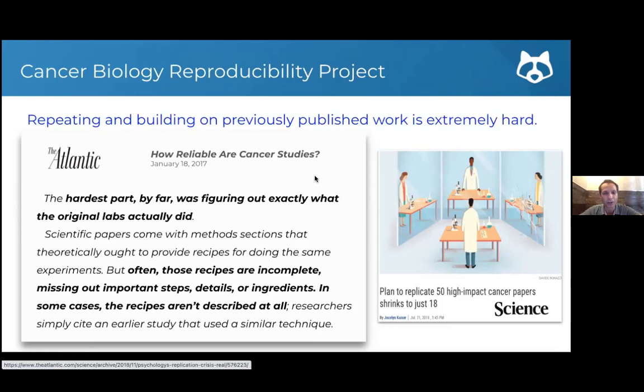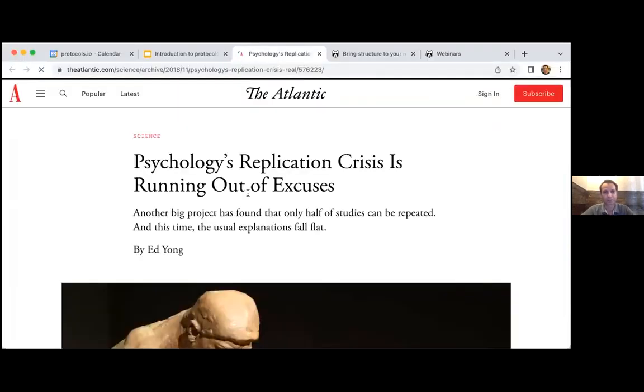It's also about how we're keeping track of the protocols for ourselves, for our collaborators, inside our academic and industry research teams. So there's turnover, students graduate, employees leave, postdocs find other positions. There is turnover, and reproducibility challenges start long before a paper is published. They start as we're doing the work.